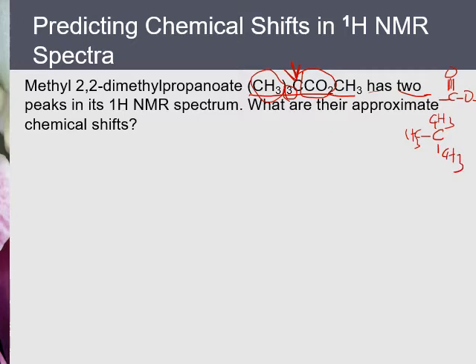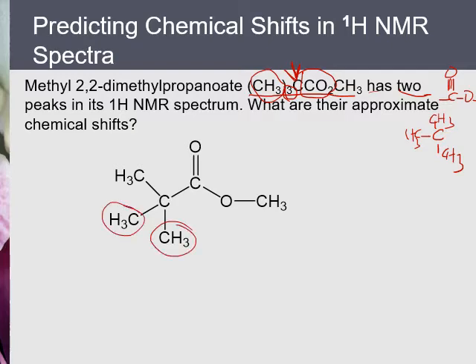So here is the structure of the molecule. And the first thing you recognize is that CH3, CH3, CH3 are all equivalent. So the 9 hydrogens all appear as a single peak. And because they connect to carbon, not an electron withdrawing group, the range should be 0 to 1.5. Okay, the most upfield, or the right side in the spectrum.